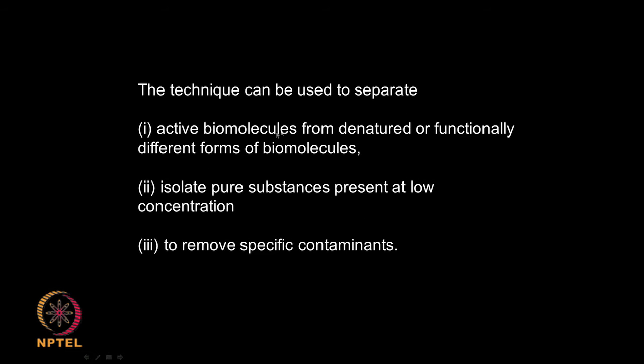It can be used for separating active biomolecules from denatured or functionally different forms of the biomolecule, to isolate a pure substance present at very low concentration, and to remove specific contaminants. Affinity chromatography is used quite a lot in biopharmaceutical applications, where we are interested in a very pure product, and it is an expensive technique because the specific ligand of interest is immobilized on the surface of the stationary phase.